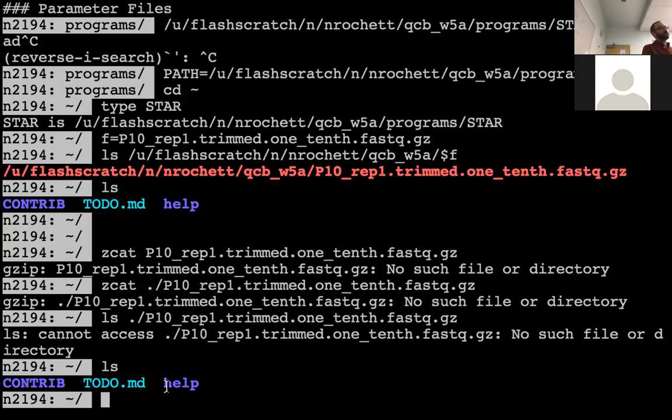Does this answer the question a bit? So basically what you need is making sure the file is where you think it is, the name is typed without typos, and the program is running from the place you think it is. So the program needs to be running from the right place, the name needs to be without errors, and the file needs to actually exist in that place.